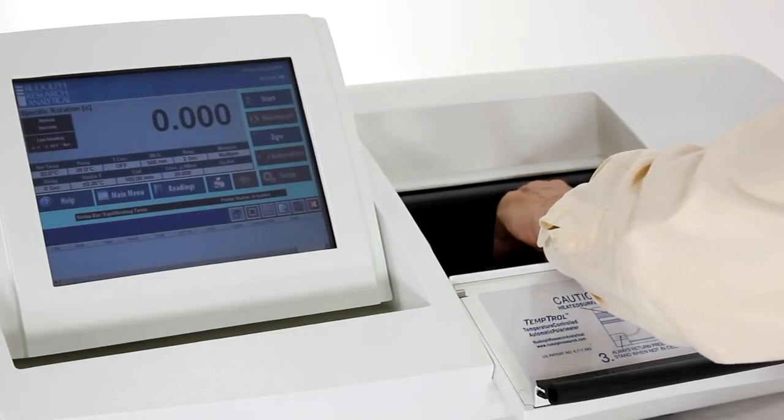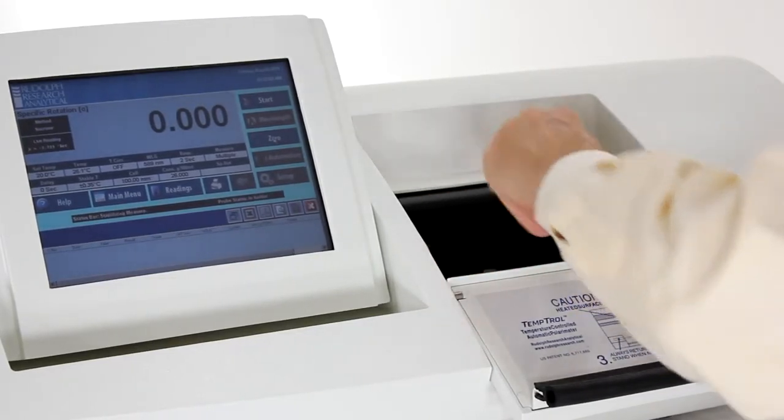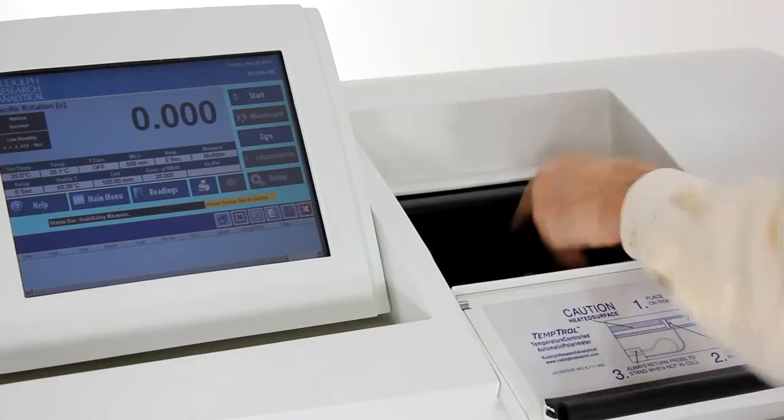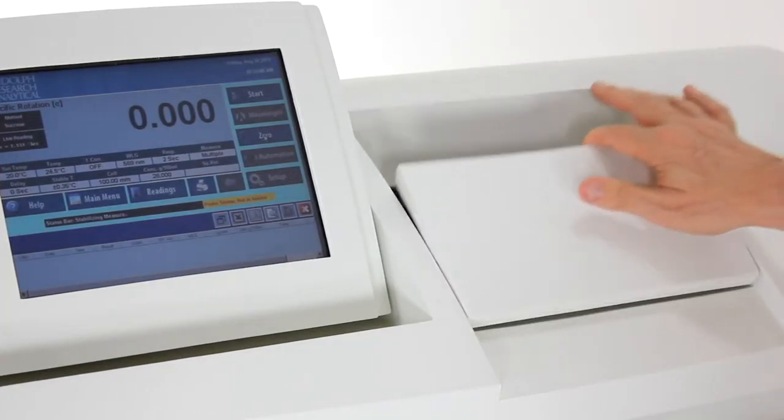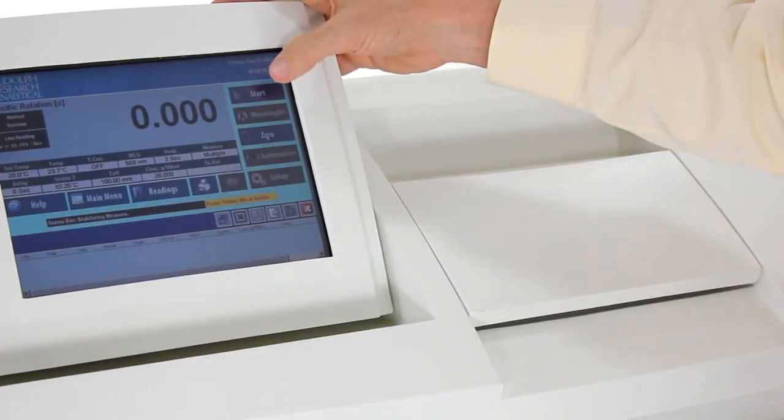We'll now place the cell back in the chamber. Temperature sensor inside the cell. Slide the cell to the end and I can push the start button.